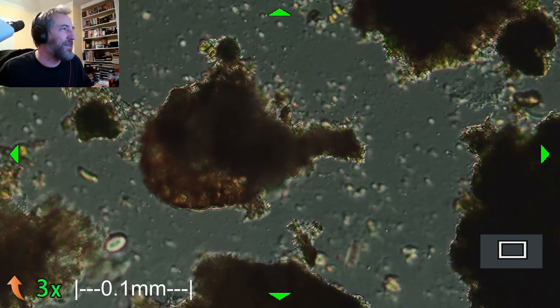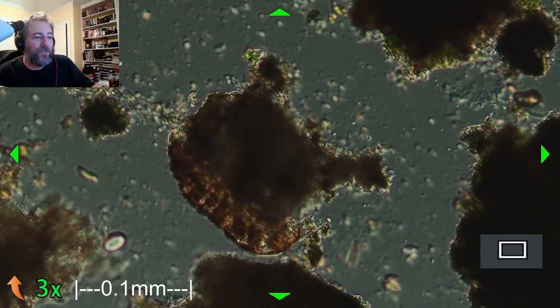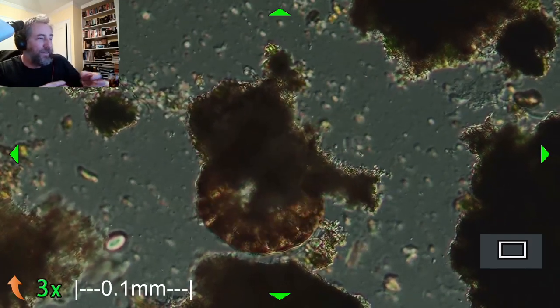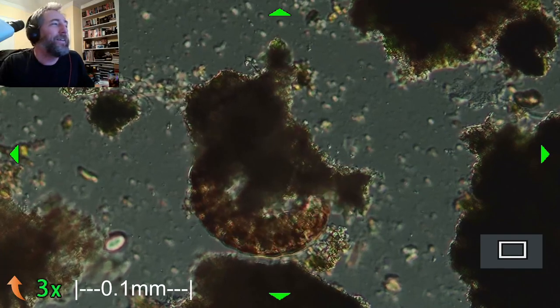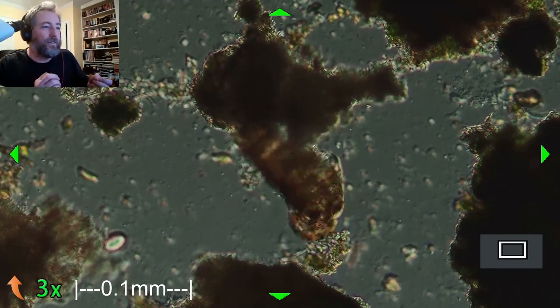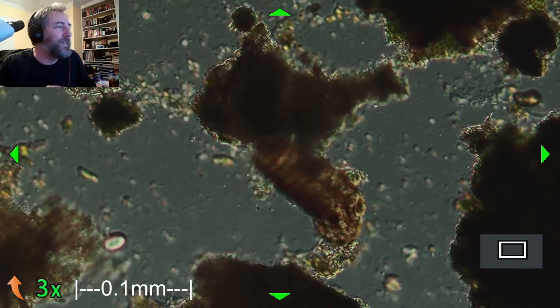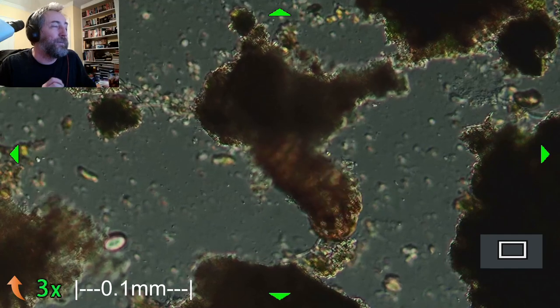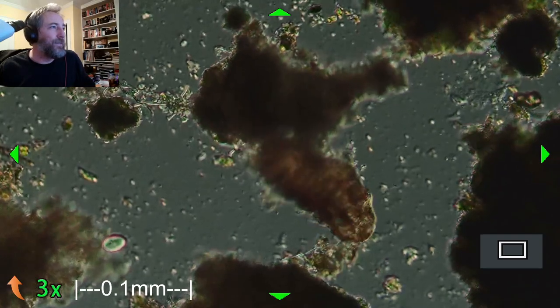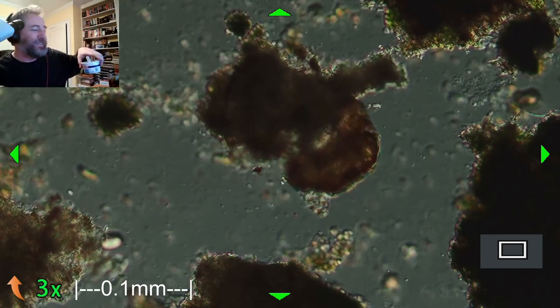And then to get this sample for you guys, what I did was the normal thing that I usually do, which is take a knife and lightly scrape off the lichen and the moss and anything that doesn't look like it belongs on the stick. In this case, it was a combination of really light colored, sage colored lichen, and then some darker greens and brown colored lichens. I scraped them into a sour cream container. I like to recycle.